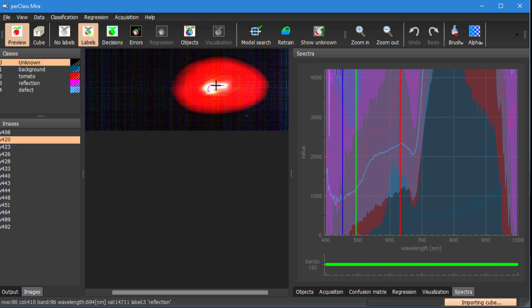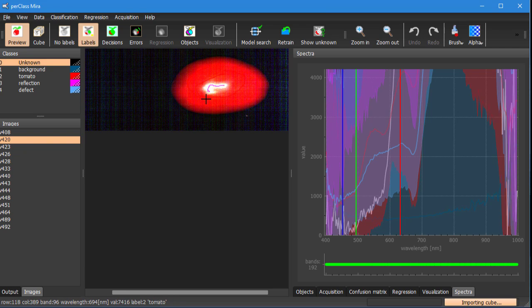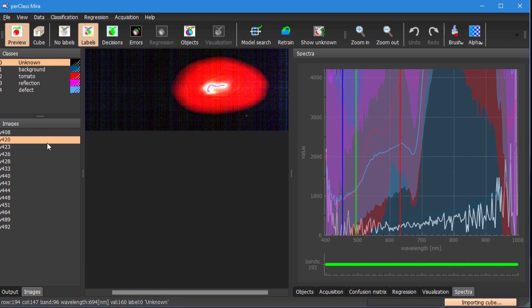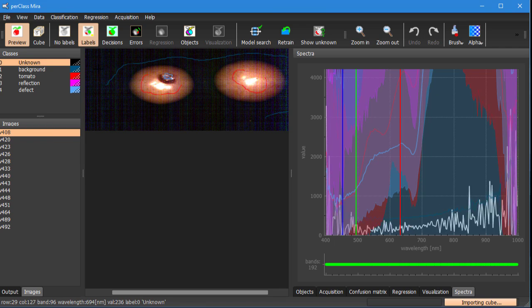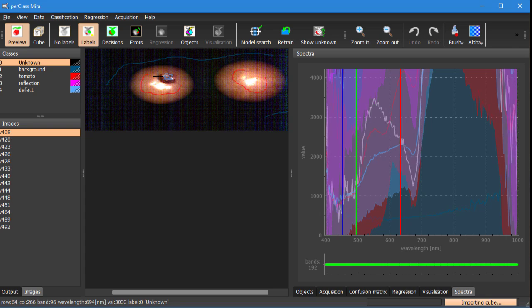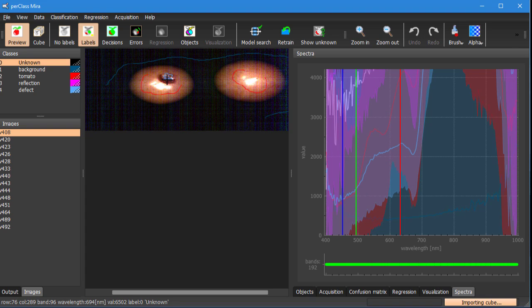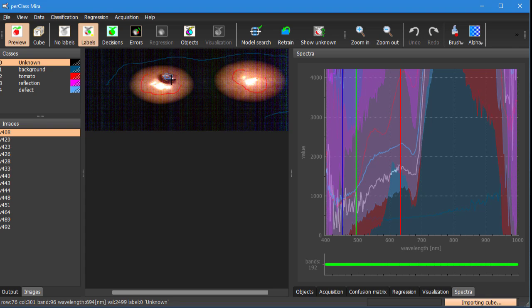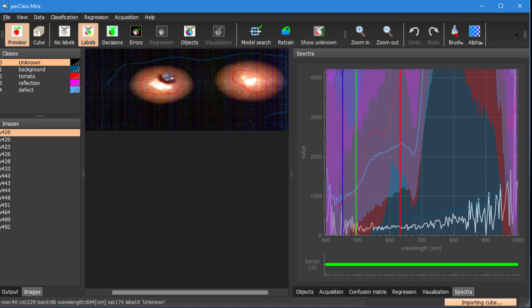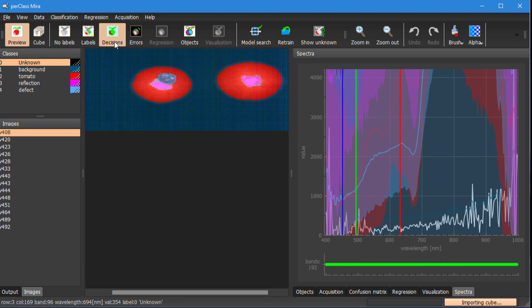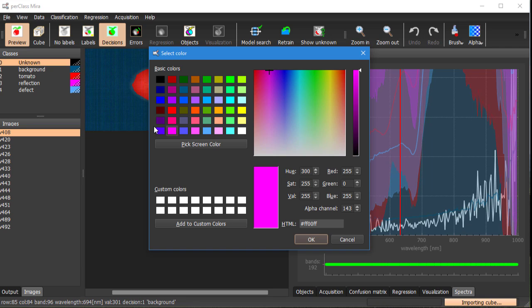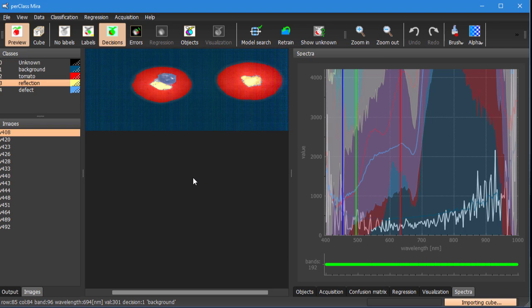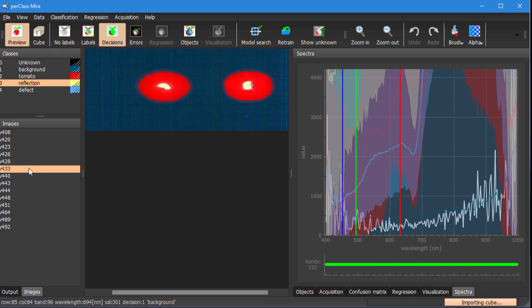Reflection is helping us to get rid of specular reflection areas that we don't want to include in the analysis and defect is removing some of the defects that we also don't want to use for a regression. So we have a pixel classification model that we can apply to any scan and we can now proceed with regression modeling.